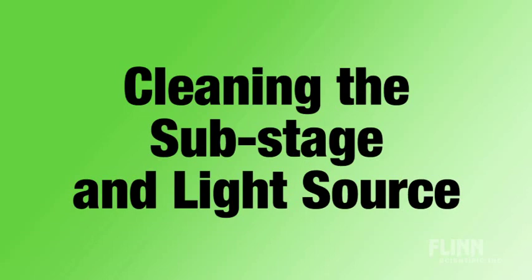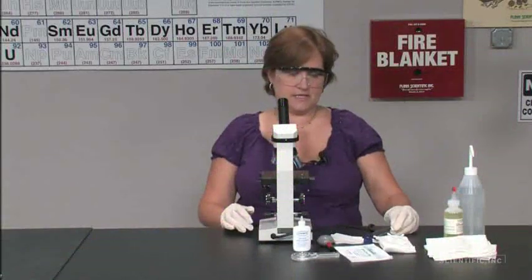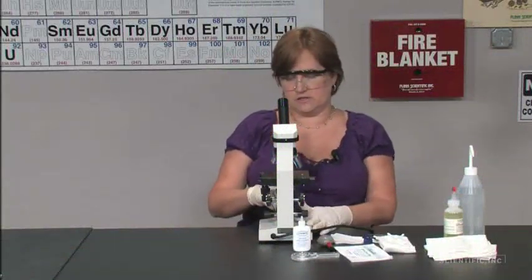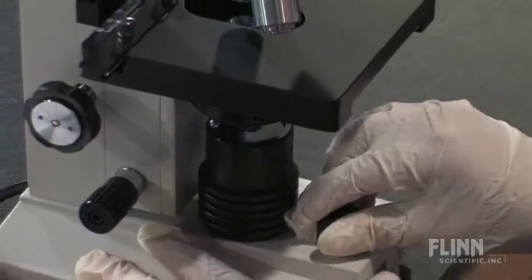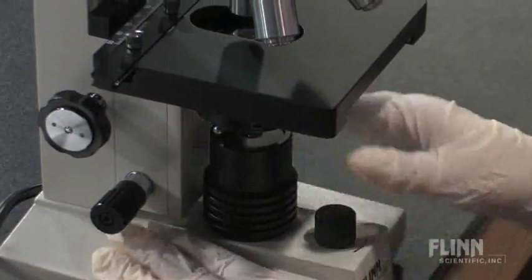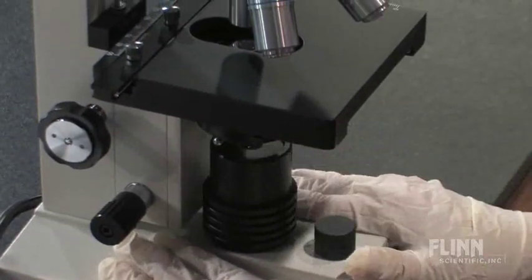Moving beyond the objectives to the sub-stage and the light source. You're going to want to make sure if you have an older microscope where these get hot that they're cool before you do any cleaning.